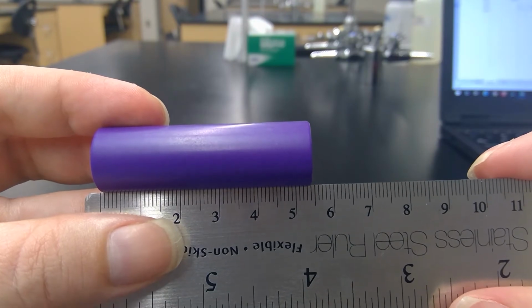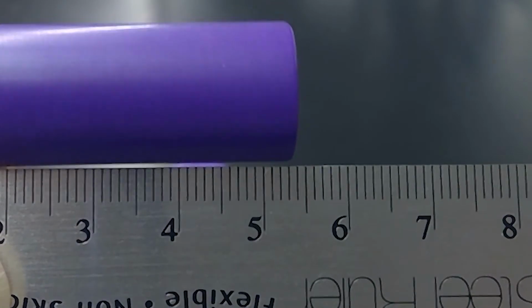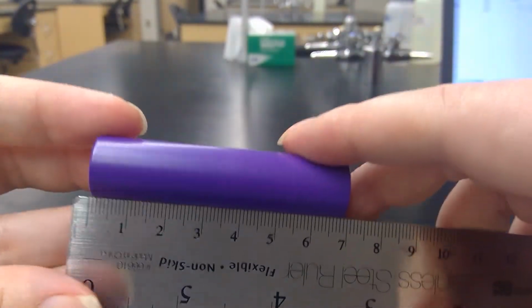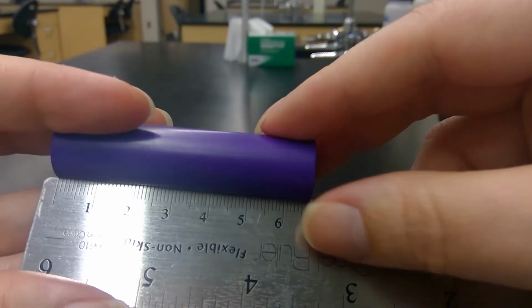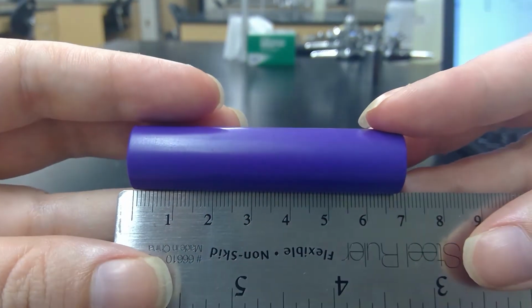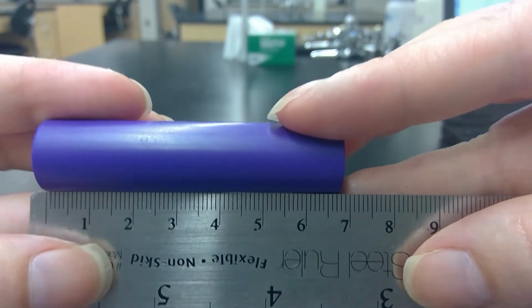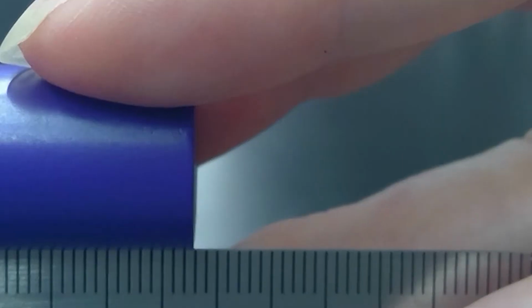So record the length. Sorry, I'm shaky for some reason. And this is the longest one. So make sure. All right, so record the length.